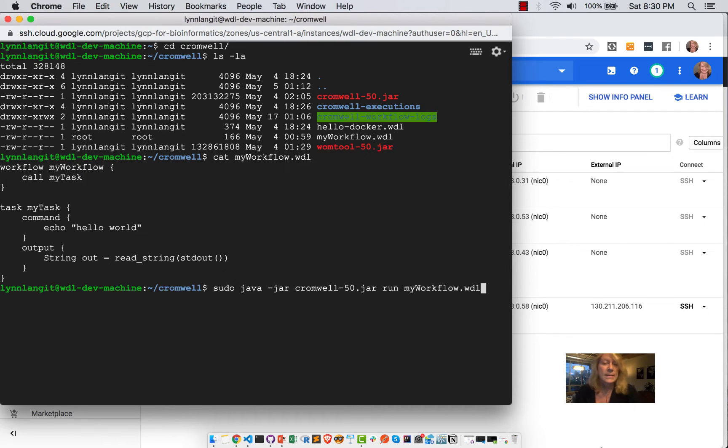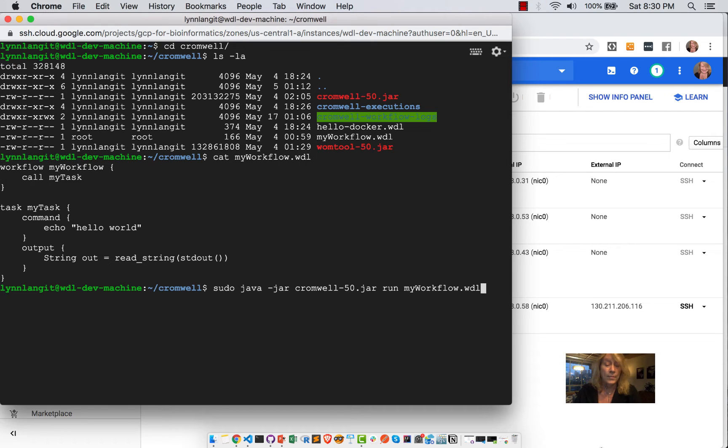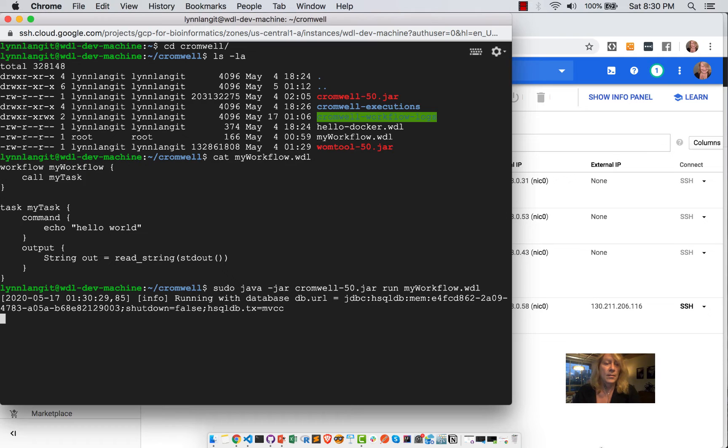So the syntax is, we're using pseudo just because of permissions in the directory, but Java JAR Cromwell 50 JAR run my workflow.